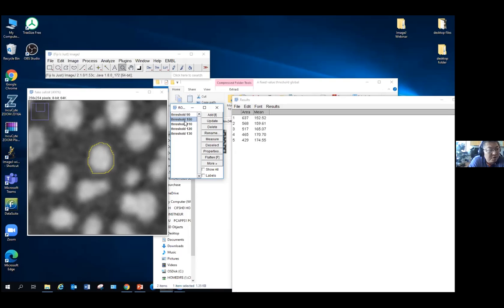But once you choose the value for this image, say the thresholding 110 or 130, then you lose the flexibility to change it. You have to use the same value applied to all the images in your control group. You should use the same thresholding on all the images in the experimental group. And only in that case can you ask: do I see a statistical difference between the sizes?